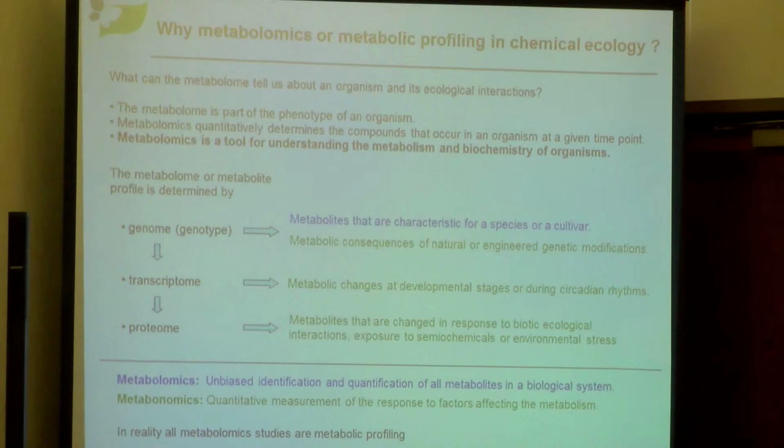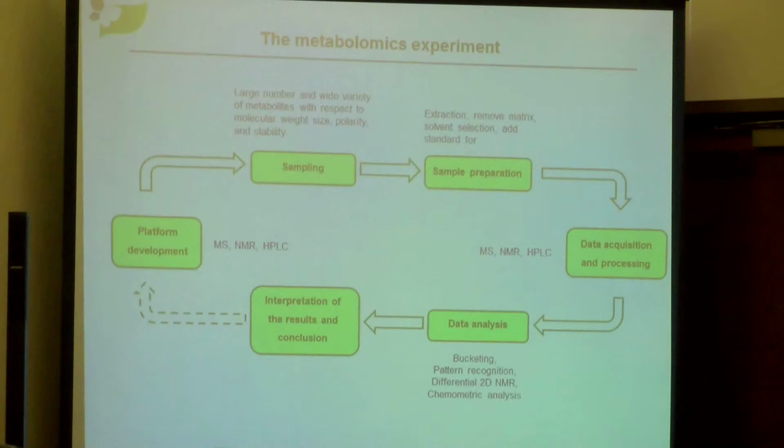What we are doing in reality is metabolic profiling, because we are not yet in the situation that we are able to identify really all the metabolites in a biological system. So the more correct term would be, in my opinion, metabolic profiling. The metabolic experiment is well known to you, and I do not want to go into the detail here, but I would like to focus a little bit on this point, data analysis.